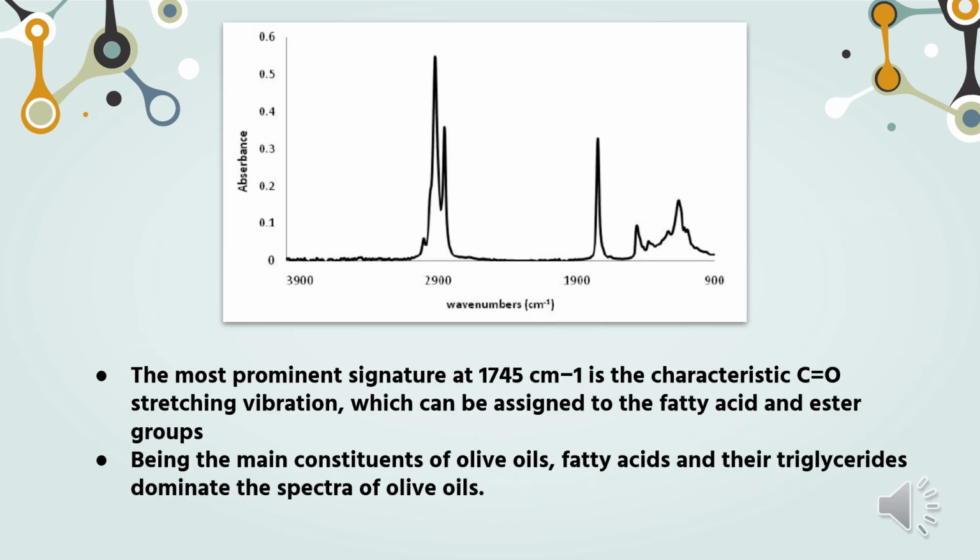Based on the diagram shown, the most prominent signature at 1745 cm-1 is the characteristic CO stretching vibration, which can be assigned to the fatty acids and ester groups. Being the main constituent of olive oil, fatty acids and their triglycerides dominate the spectra of olive oil.